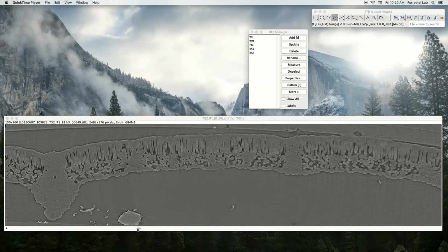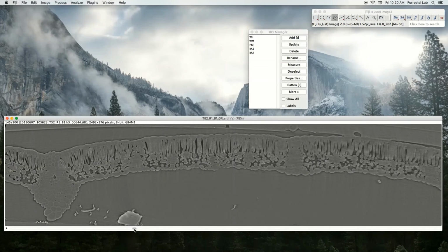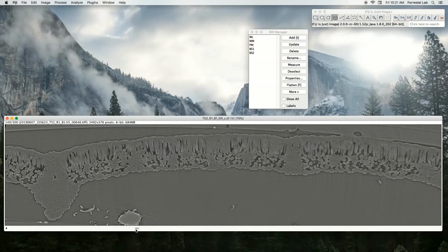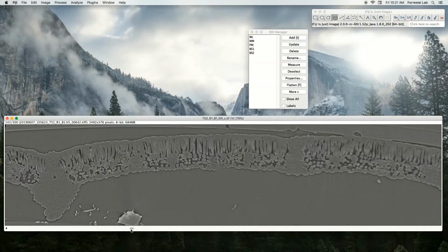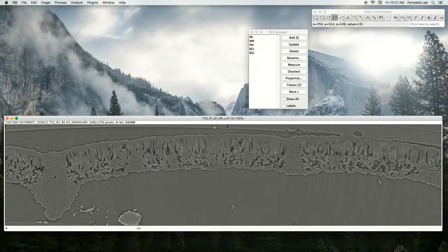You can tell these apart from the bundle sheath because they don't intersect with it. Oh, this is also an important tool. You can move around to see ahead and behind what is exactly a vein and what is something else. Very helpful. Come back to the original.